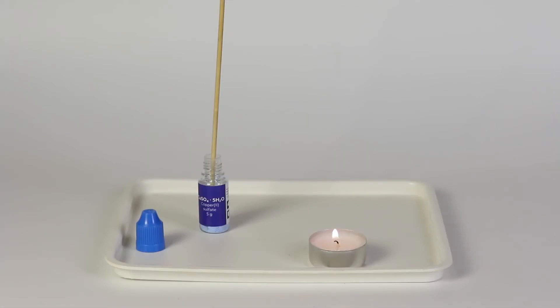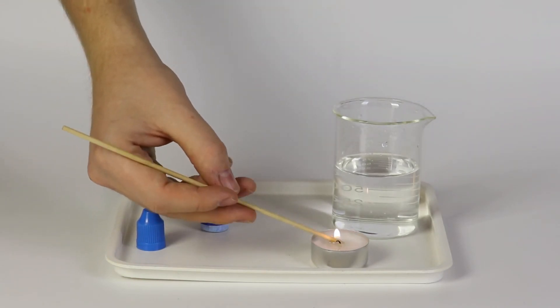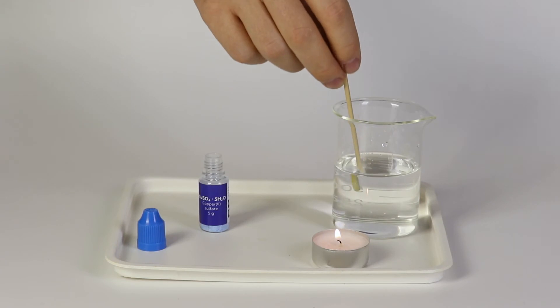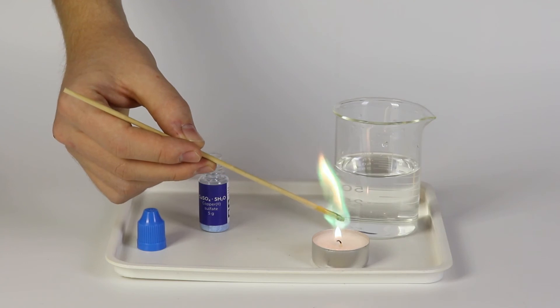Dip the splint into the paraffin once again and after this, into the water in the beaker. Put the splint into the candle flame and you will see a green sparkling flame.